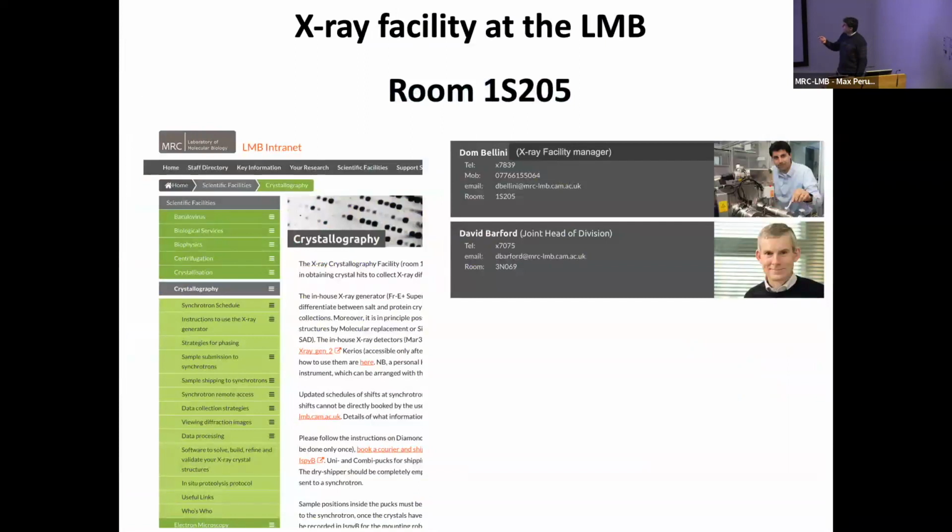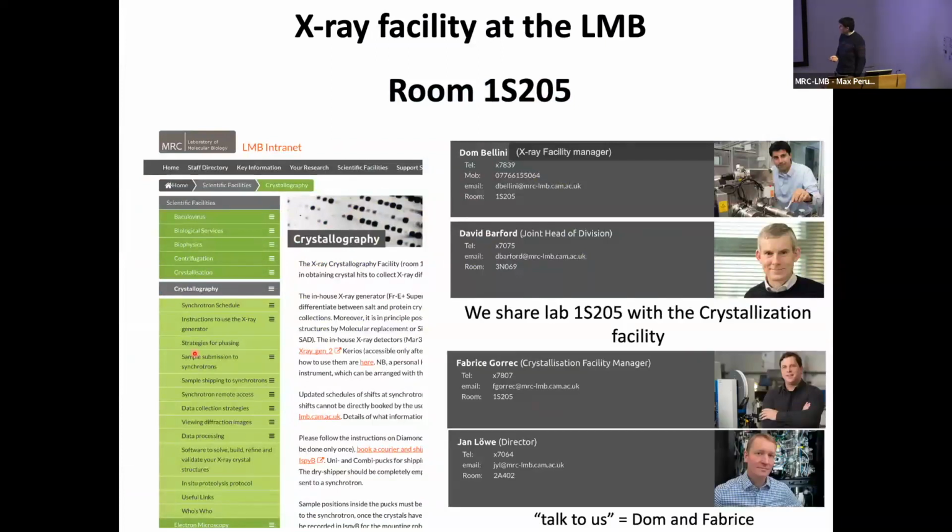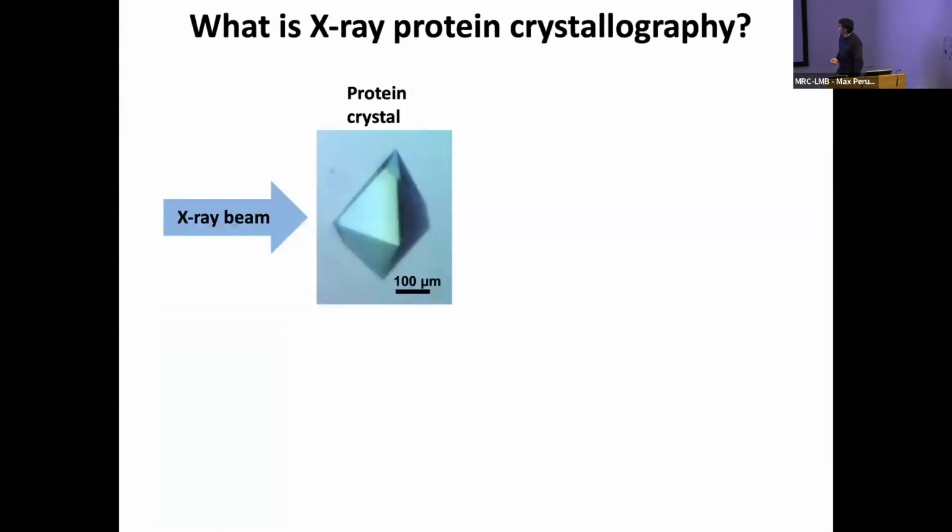So the X-ray facility, if you don't know, we are in room 1S205 and next to mass spec. I'm running the X-ray facility under the supervision of David. And Fabrice, who is already giving his talk, is running the crystallization facility under the supervision of Jan. Fabrice asked me to talk about the crystallization facility as well, so we'll tell you something about what he does with the crystallization liquid handling robots.